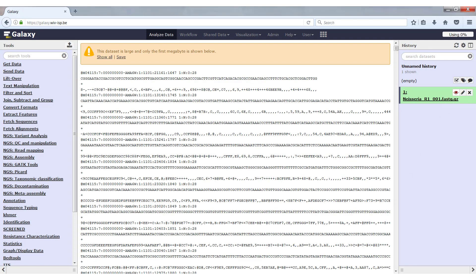To have a quick look you can use Galaxy, but if you want to manipulate or do manual searches in the file it is best to download the file and use other software to process it.